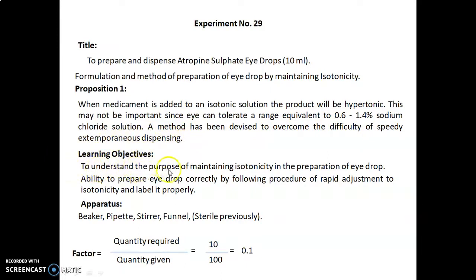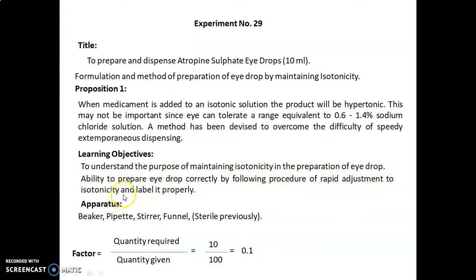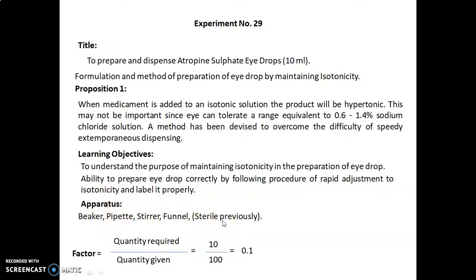Learning objectives of today's experiment are: to understand the purpose of maintaining isotonicity in the preparation of eye drops, and the ability to prepare eye drops correctly by following the procedure of rapid adjustment to isotonicity and label it properly. Apparatus required are beaker, pipette, stirrer, and funnel — all previously sterilized.